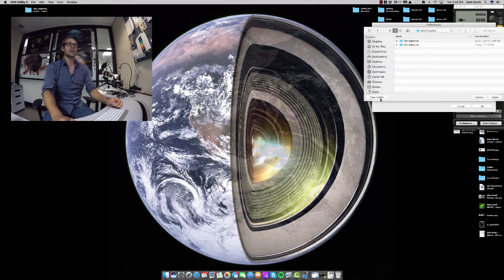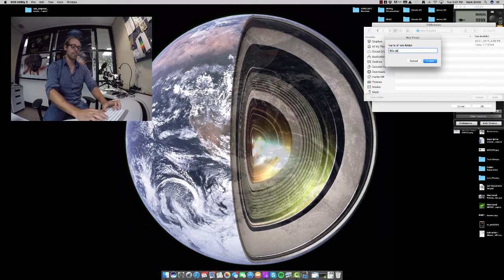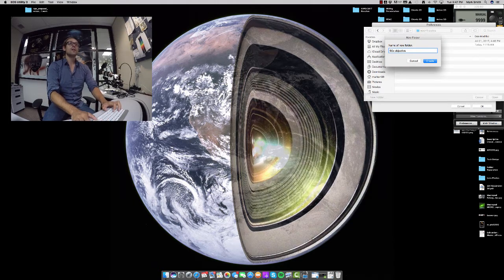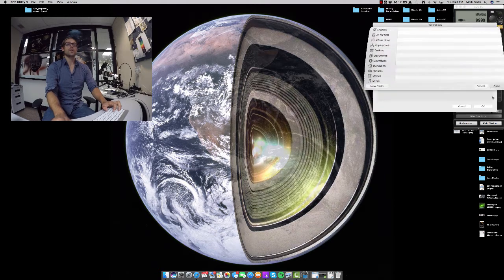We'll just go to the folder icon and navigate to where we've been storing our photos before. In this case, it's Weevil scales, new folder, 50x objective. We're going to create that folder, press open.